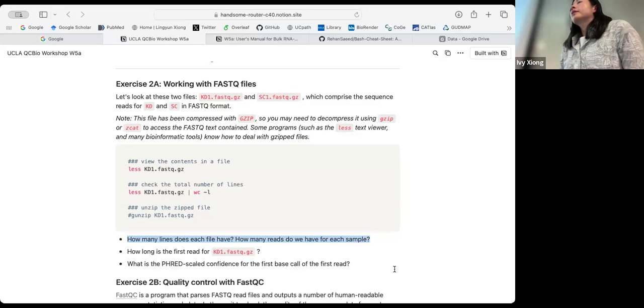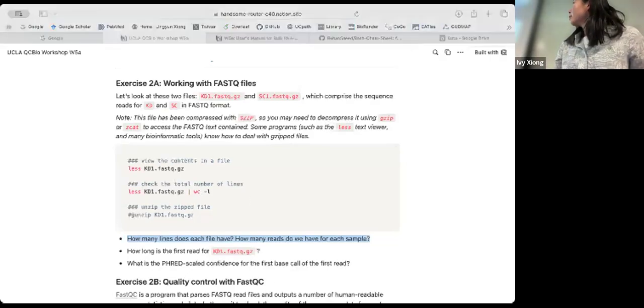Question about less: how do you return from that? Oh, press the letter Q to quit. Less. Okay. I want to see both of them. Can you see them together? To see the next one, maybe the other fastq.gz, wc. Right, yeah, you have to quit that first. Never mind, sorry. Yeah, we can try again. We'll try together.